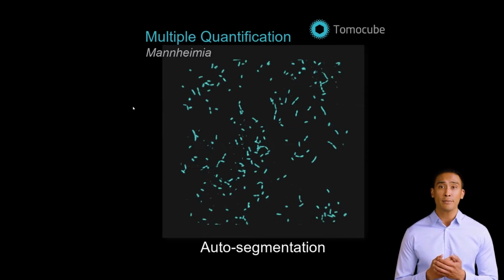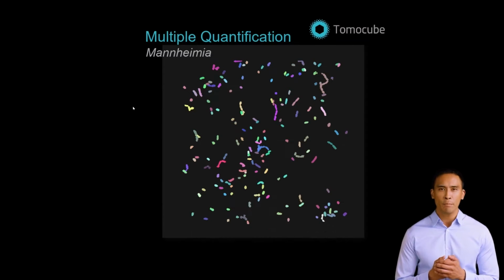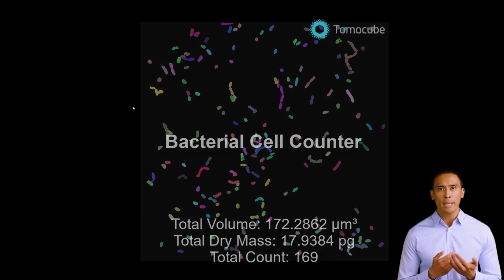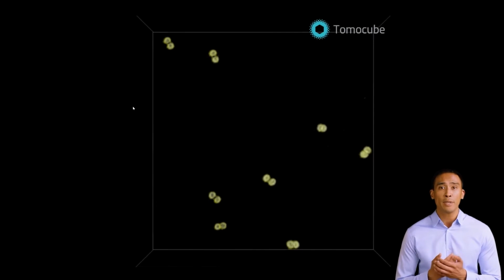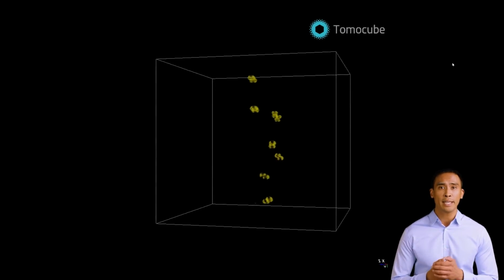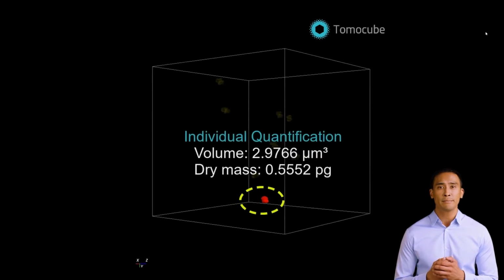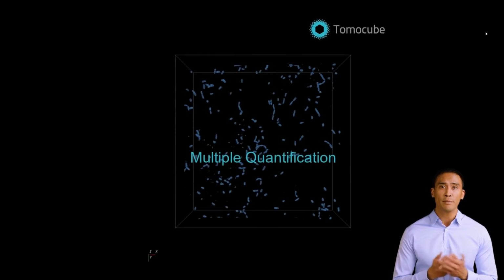HT2 reconstructs 3D distribution of the refractive index of individual bacteria with the resolution of 110 nanometers, from which quantification of the biomolecular concentration of each bacterium can be retrieved because there is a linear relationship between a biomolecular concentration and a refractive index. Because HT is a 3D imaging technique, the volume of each bacterium can also be calculated. From the measured concentration and volume of a bacteria, the dry mass of the bacteria can be obtained.